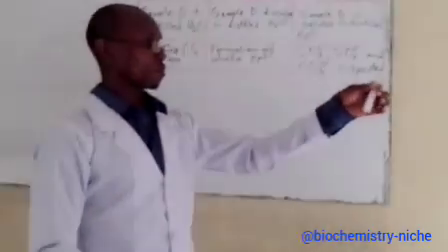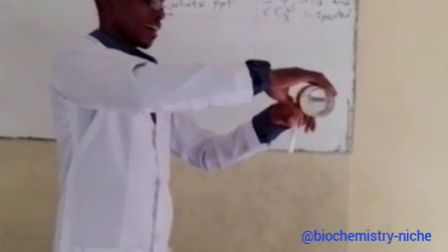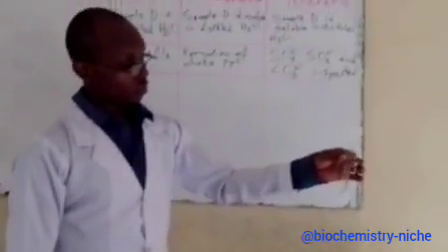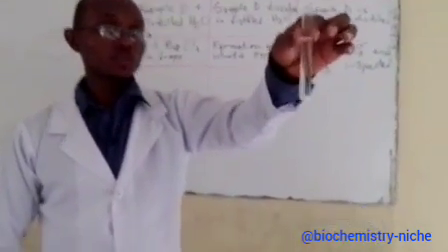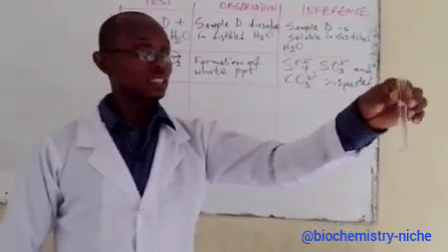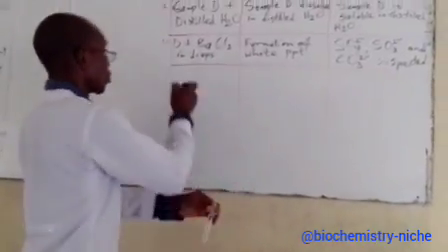I still have some particles in this. So let me see, if I were to add hydrochloric acid in excess, what happens? Well, you can see that the particles have cleared out. All of the particles in it have cleared out. So there's no more particle in this substance. So we do not have any precipitate any longer.